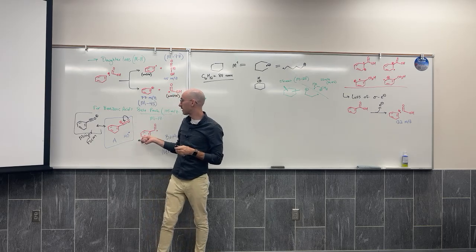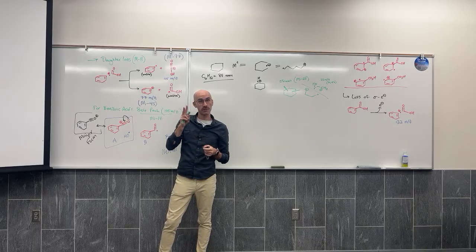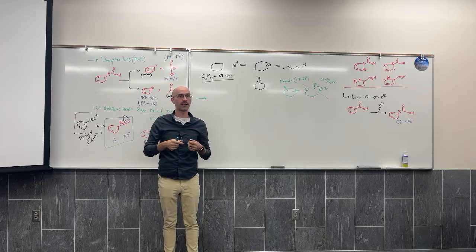Yes, just like we said, it's possible for the signal to be mass per charge and the charge is +2. So the mass that you think you're getting is actually half of the mass because the charge is twice the charge.